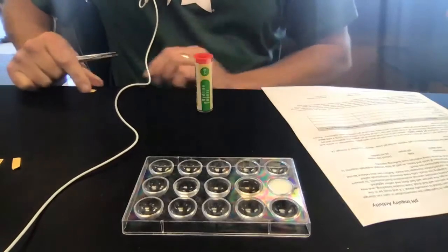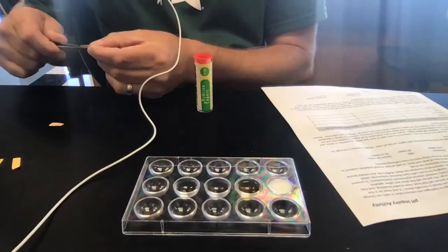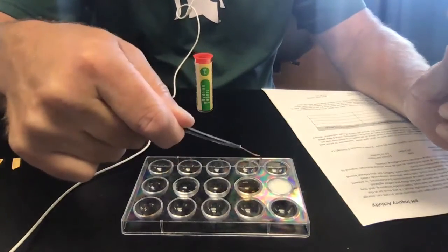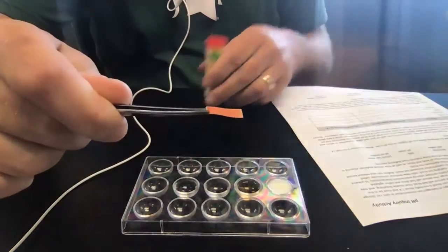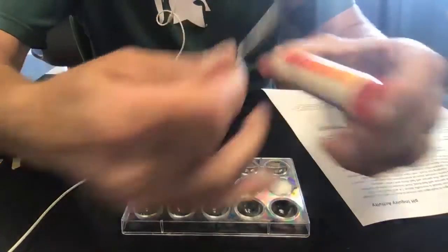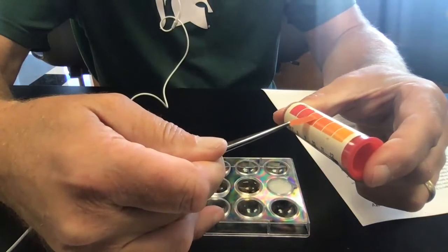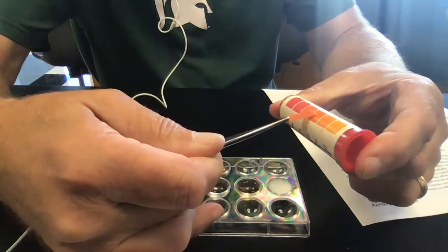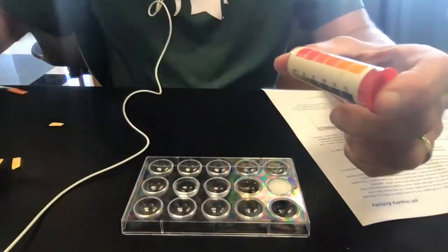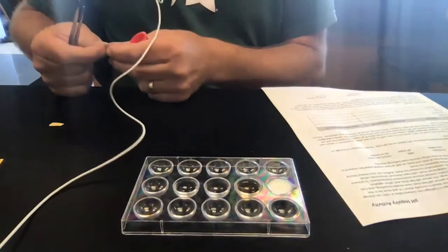Grab another sheet, wipe off the tips of my forceps. I'm going into the vinegar. Let it come out. And I can see I'm getting a very different color out of the vinegar. That's going to be much lower on my scale. And if I go to match it up, I'm getting right around pH 3. Somewhere between 3 and 4. I'm going to call it a 3. So pH 3 for vinegar, which makes sense because vinegar is known to be very acidic.